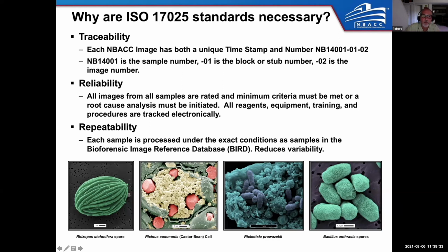I thought it was cool. The second image here, Ricinus communis, is simply a broken open castor bean, and this is most people's favorite image that we produce for some reason. It's very Christmassy looking. This is actually a single cell inside this castor bean.